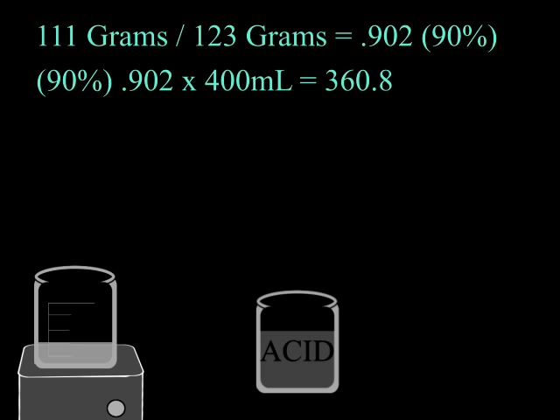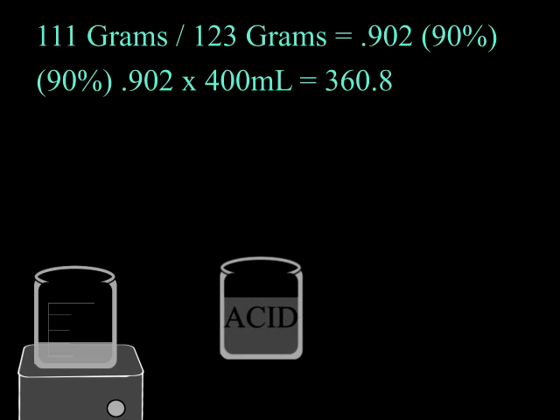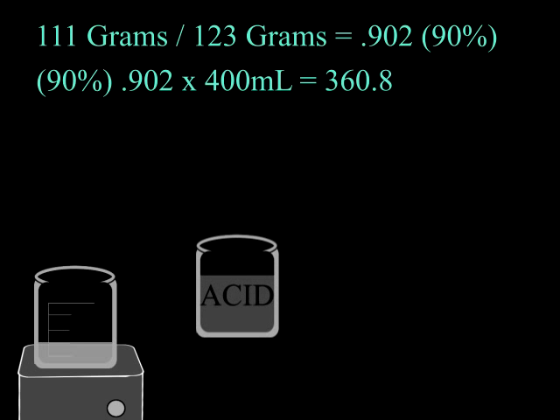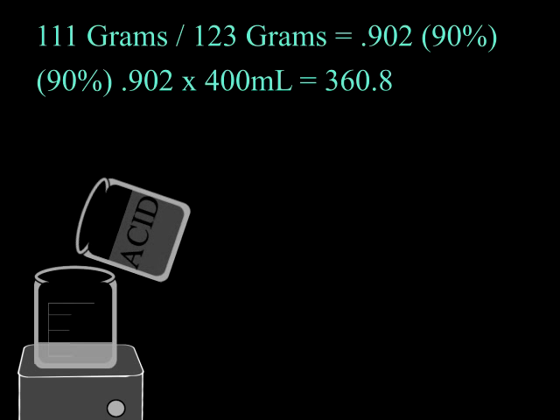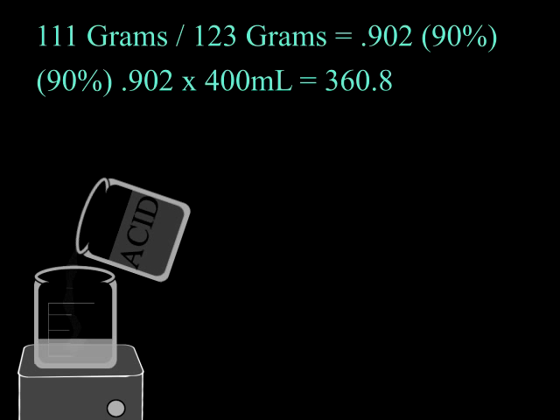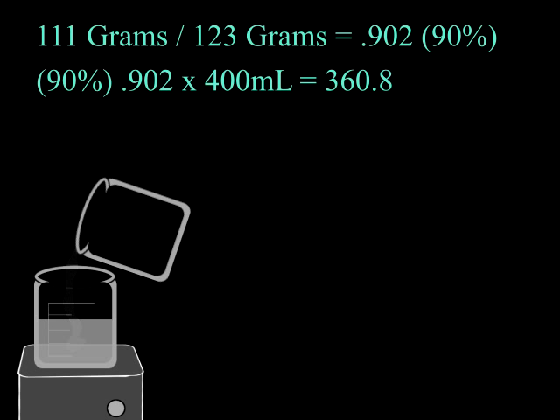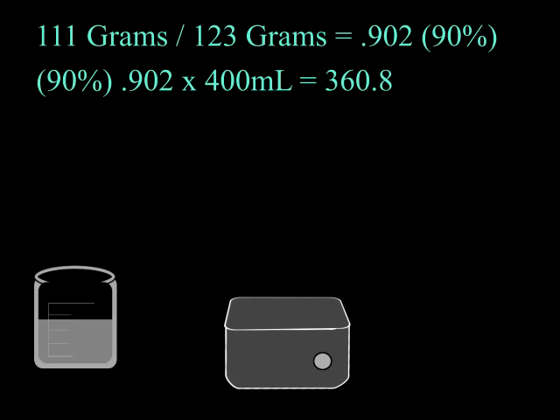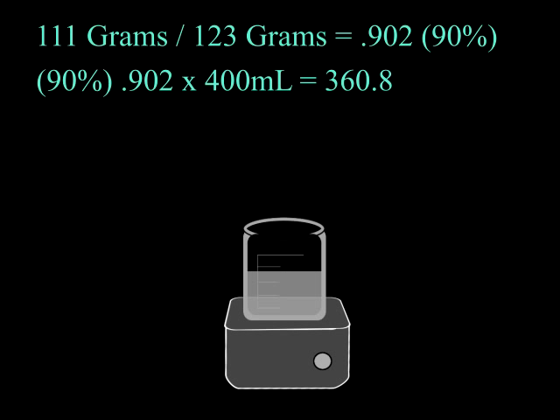Now that we have our acid amount figured out, we can add it slowly to the copper carbonate. If you have your sep funnel, now would be a good time to use it. Set it up and begin stirring and adding your acid slowly, as it will give off gas and may bubble over if you do it too quickly. After all of your acid is used up, continue stirring until it no longer bubbles.